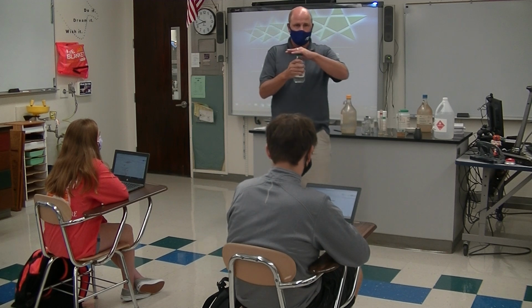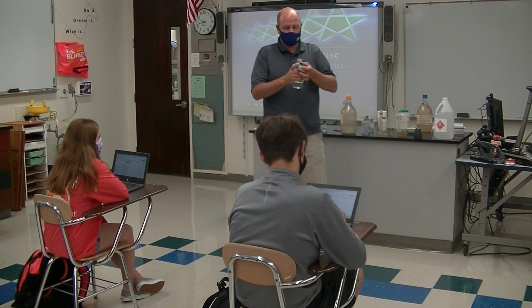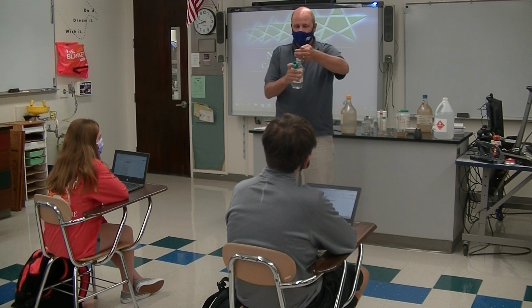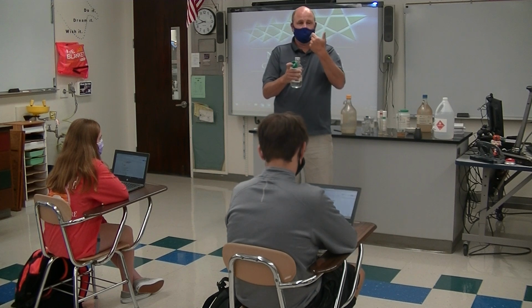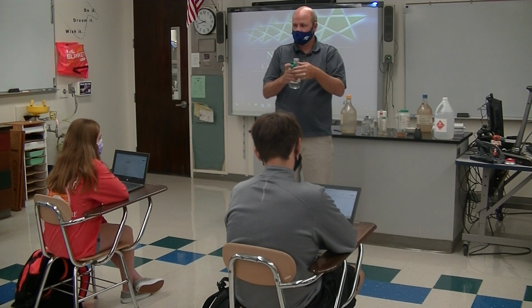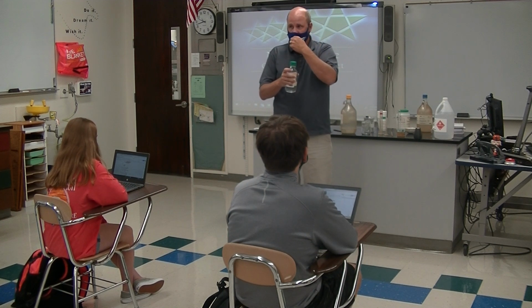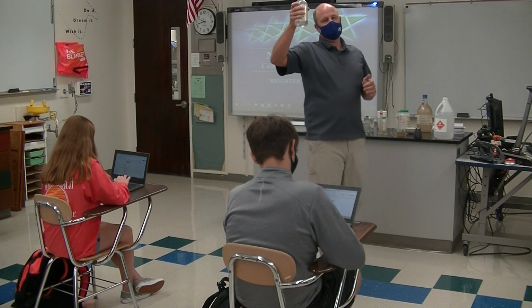So I'm going to open this up, and I'm going to take my hand and cup it like I'm cupping the air. Think of it like cupping water, and I bring the air to my nose. Notice I'm not bringing the bottle towards my nose. I'm just cupping the air, and I can smell it, even through my mask. So you're wafting carefully, that's the terminology. We need to identify this odor before we move on.